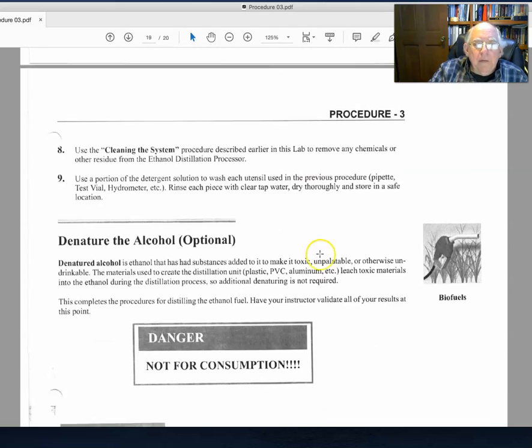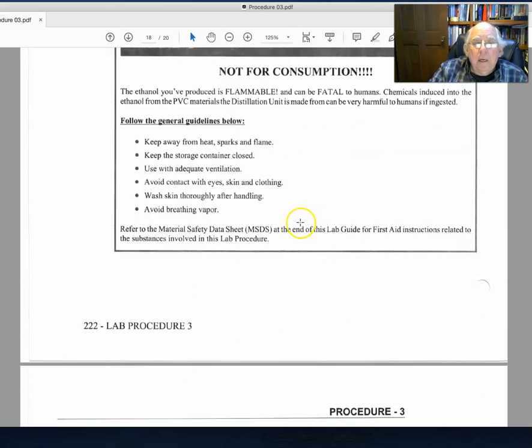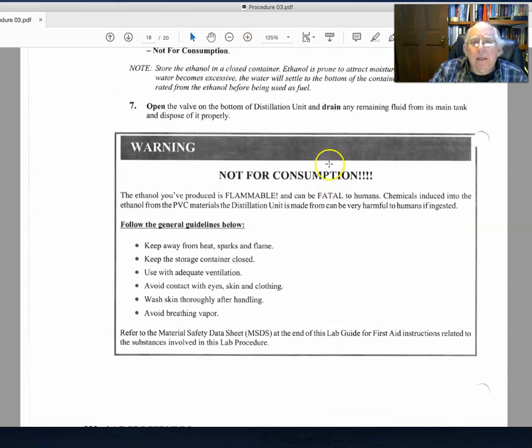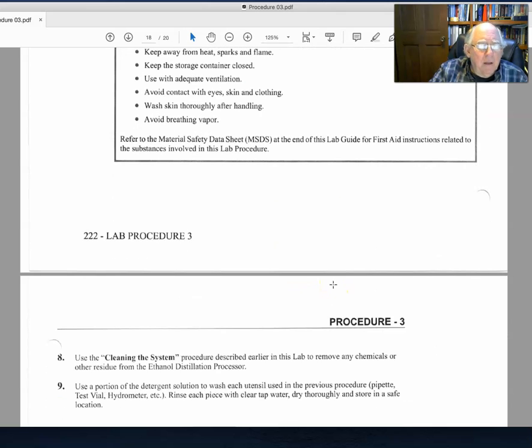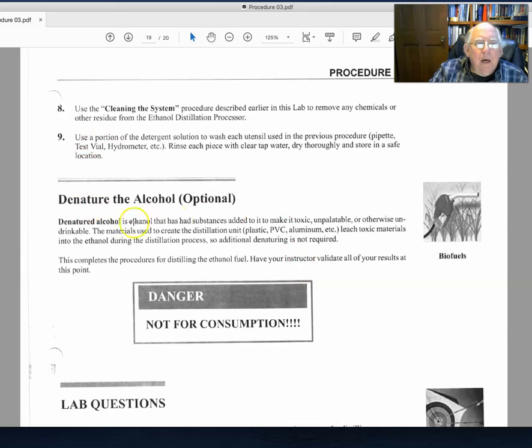Being very careful—I mean this is basically moonshine if we've heard the term, and it's not to be consumed. In any kind of distillation there are some other types of products such as methanol that actually can come out of the system that is deadly or could cause blindness if one were to drink it.